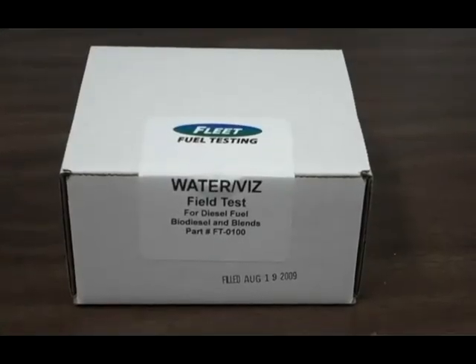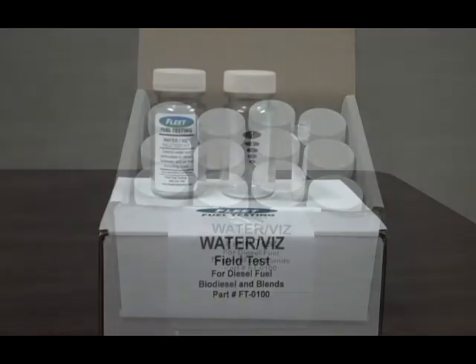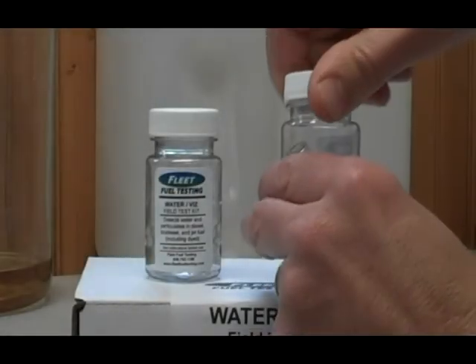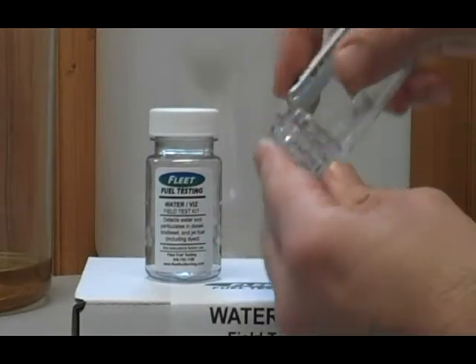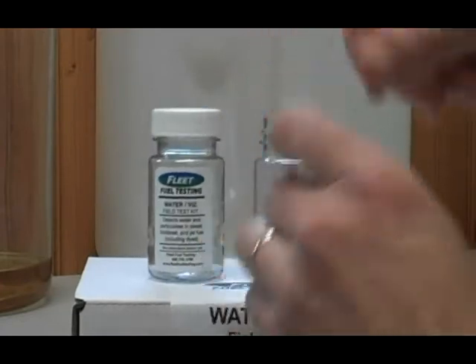When the test arrives it comes in a box of 12, and there will be 12 individual tests in the test kit. What is here is a test bottle, and inside the bottle is a small tube with the water indicating solution.